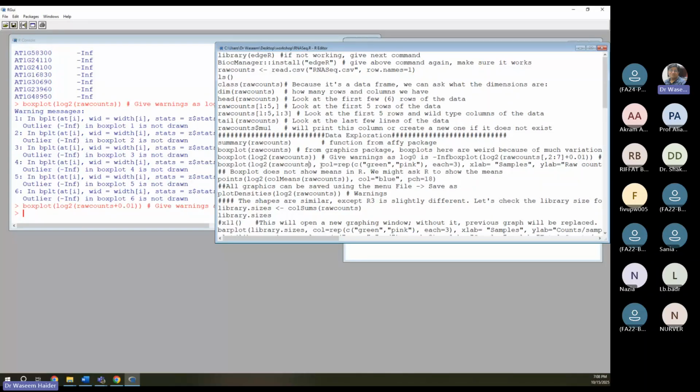So we are adding colors to this. Then we are labeling the x-axis and y-axis here. X and y are not labeled. We can label them, and you can change them as per your own wish. If you have your own data and these names are different, you can change them here. You can change the y labels. You can change the x labels. So when we execute, it goes like this.